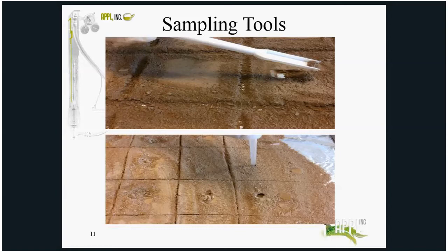These representative lab subsampling procedures are designed to follow through on the correct procedures for reducing potential sampling analysis errors with the field MI samples. Ideally, this should also pertain to the discrete samples.